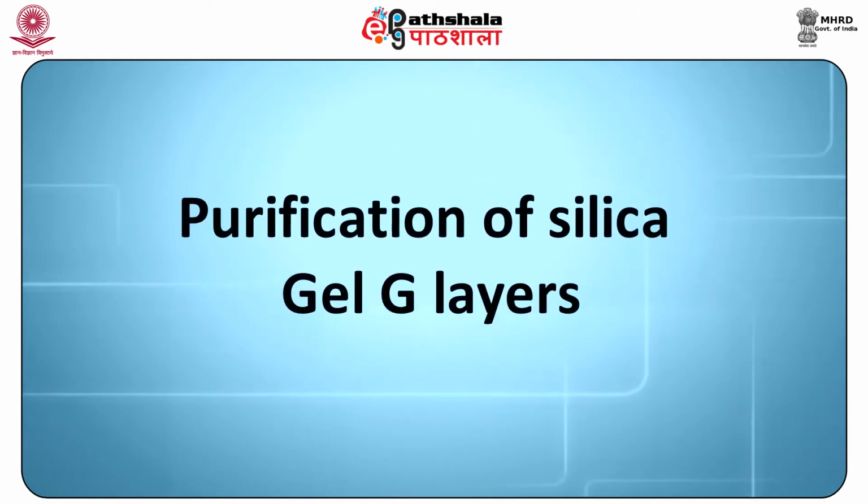Purification of silica gel G layers. Silica gel G contains iron as an impurity, which causes a considerable distortion of the chromatograms. Iron-free layers are obtained by giving the coated and air-dried plates a preliminary development with methanol and concentrated HCl. This leads the iron to migrate to the top level of the plate and reactivation can be performed on the TLC plate.